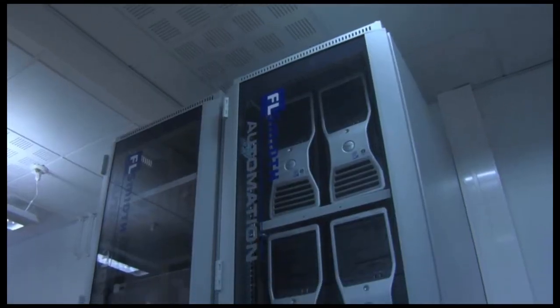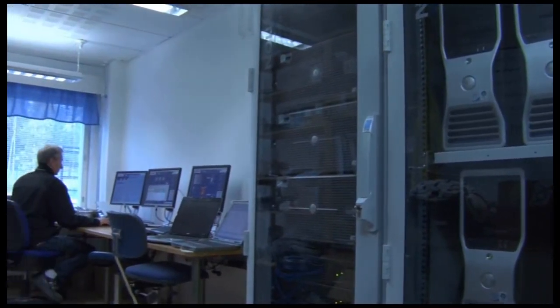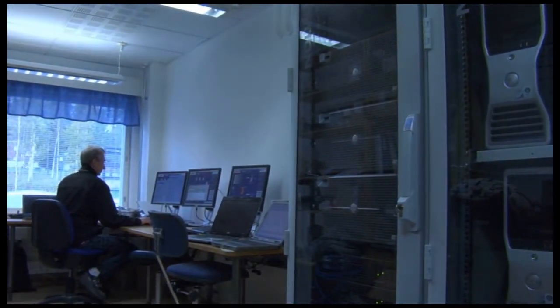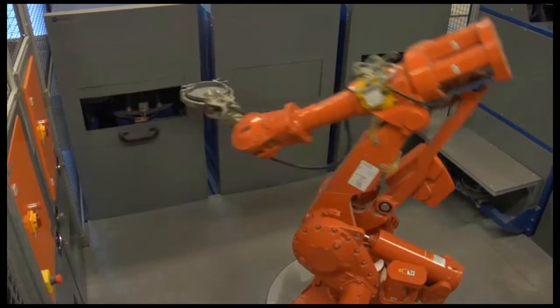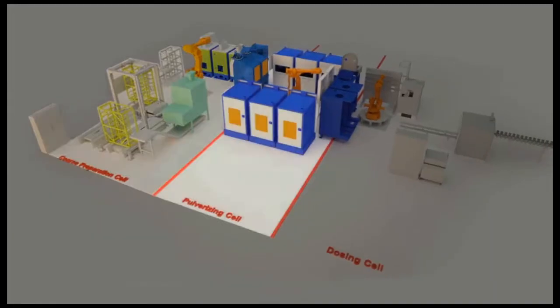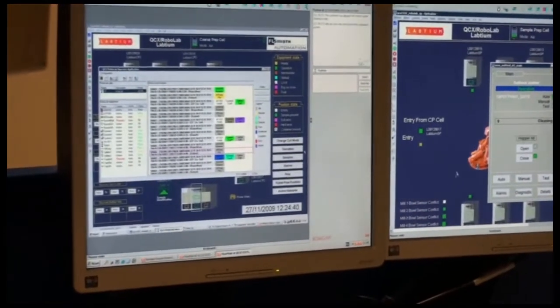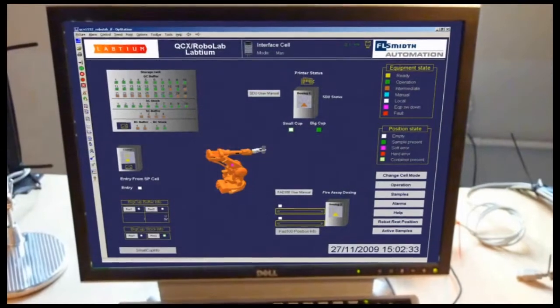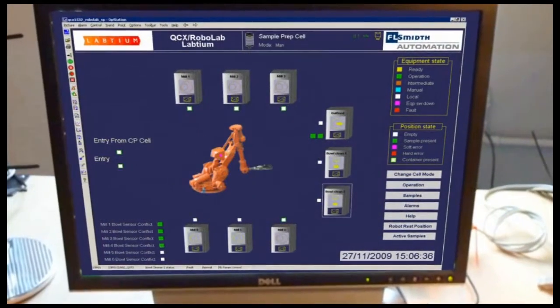The server room is the heart of the QCX RoboLab. Here, three PC servers ensure that the system is in full operation at all times. Even though the QCX RoboLab operates as one system, each cell is in fact controlled by its individual server PC. This software layout ensures greater flexibility and high efficiency during commissioning, as one cell can be commissioned independently of the other cells.